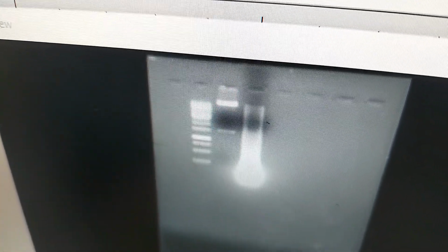So there is some RNA in there which is at the bottom of the lane, but if you look at the top, it is mostly the smear. It is due to the presence of a lot of PvuII sites in the genomic DNA of wheat. Okay, so we will try to save this picture so that you can keep it in your records. And that's the end of today's experiment.